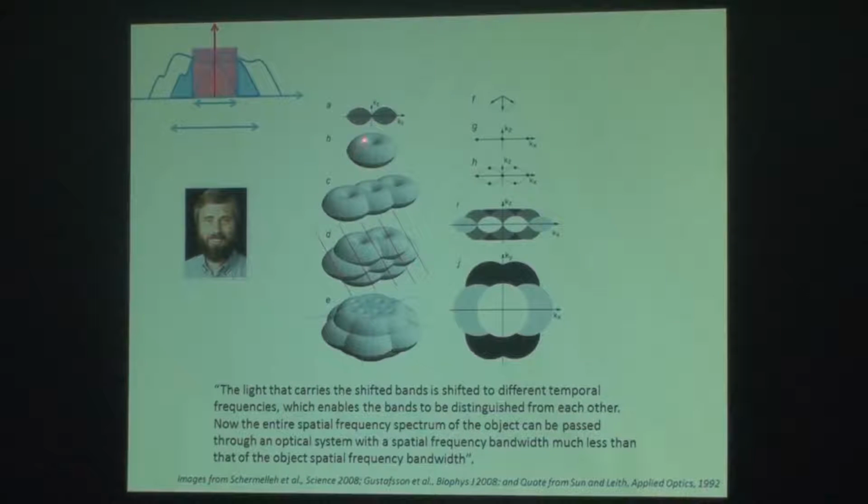And this leads to, when you look at the conventional frequency space, the missing cone. This is the normal wide field microscope image. This is what people typically call a missing cone, where you don't collect information in the center, which affects your resolution. So in a 2D SIM, if you take the adjacent images, you still have missing cone information. But instead of 2D, you make this in a 3-dimensional way.